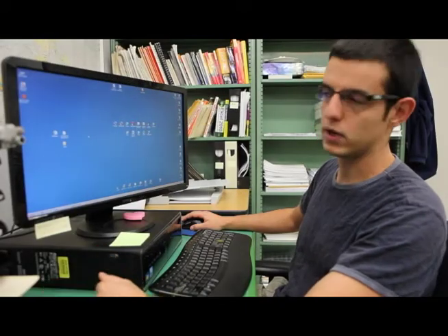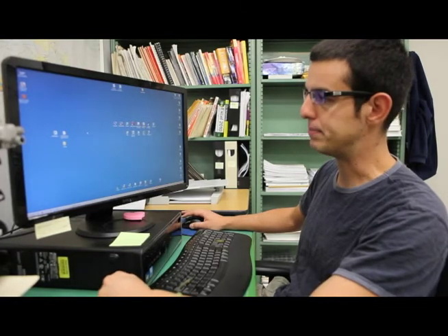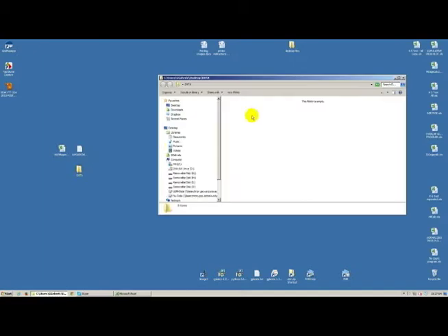So in this video, we're going to learn how to reduce the data that we've acquired on the new ICPMS. For doing that, here on the screen, I have 3 files that we're going to use. We have the new PM HCalc macro, that is the reduction program. We have one of these data files that is being produced as we analyze the sample. And we have a folder that right now is empty.